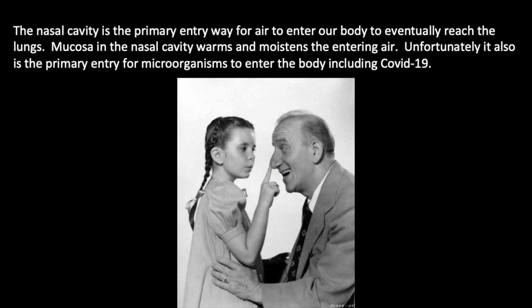The nasal cavity is the primary entryway for air into our body to eventually reach the lungs. Mucosa in the nasal cavity warms and moistens the entering air. Unfortunately, it also is the primary entry for microorganisms to enter the body, including COVID-19. Let's start the dissection of the nasal cavity.